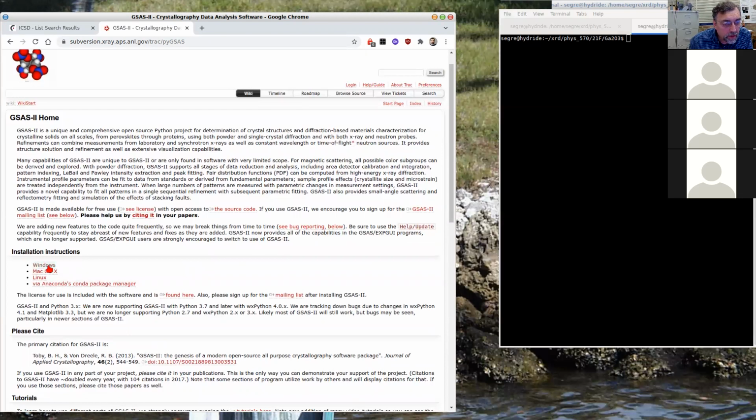You can install it on Windows, Mac OS X, Linux, or you can do an Anaconda installation where you install a whole Python environment, and it's all sort of an isolated Python environment.